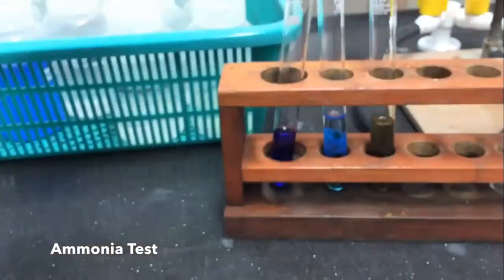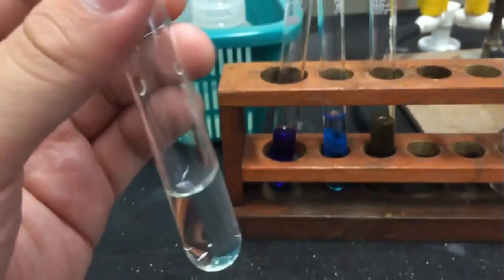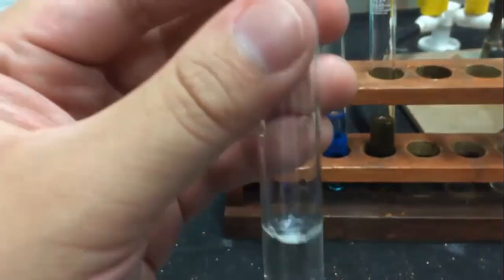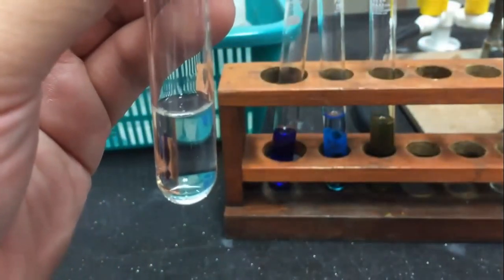You may also use ammonia to test for the presence of iron 2 ions. To a small sample of the solution, add a few drops of ammonia solution.